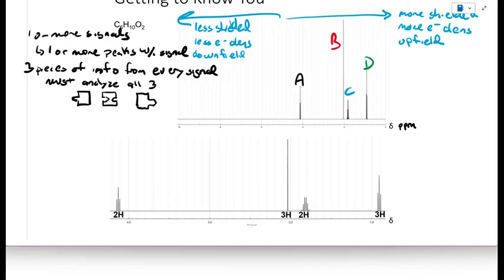And then what we're going to be able to do is look at these puzzle pieces that we've built for each of the signals, and start putting them together. So this puzzle piece could come over here. It looks like this one fits here because we know something about the puzzle piece and what it's next door to. And then this one looks like it fits here. And so we're going to take these puzzle pieces and put them together to build the ultimate structure of the molecule. That's a silly example, but we'll see how that works when we start to actually solve some of these spectra.